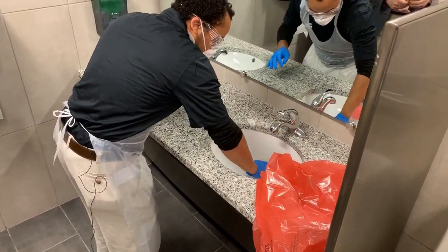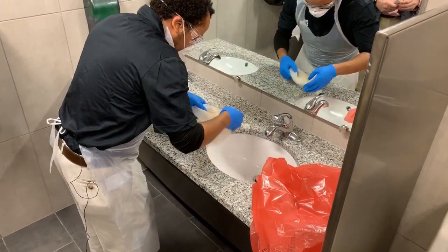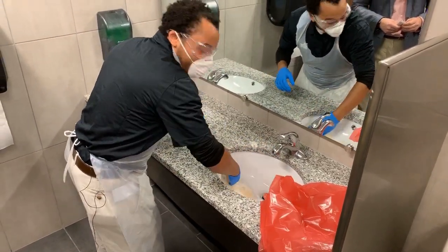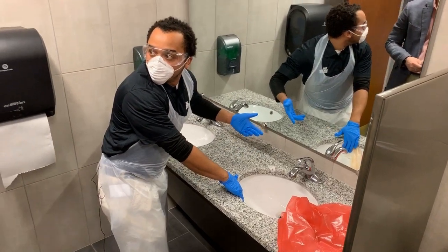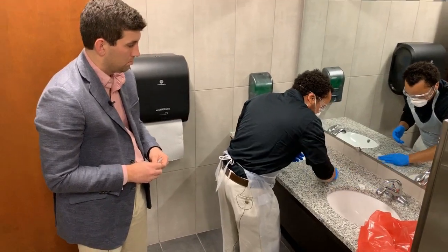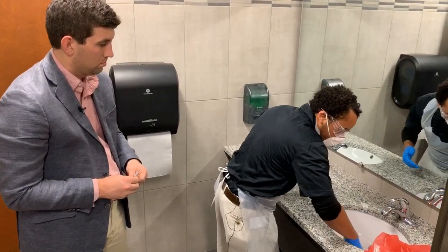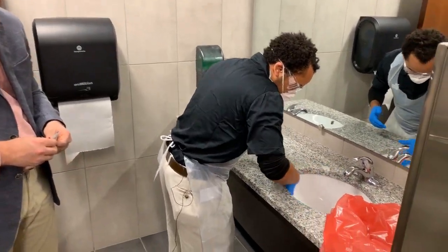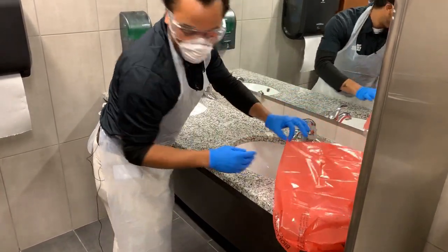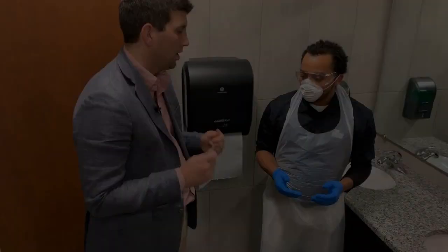Still, be very careful when cleaning this and make sure we get it all. This will disinfect any hepatitis B or potential common illnesses. You want to get it really good. You can never be too cautious or too safe when doing this. Then you put the contents in the red biohazard bag. All right, now we're going to let it sit for 2 minutes or until it air dries. Correct. All right, so it's been 2 minutes.